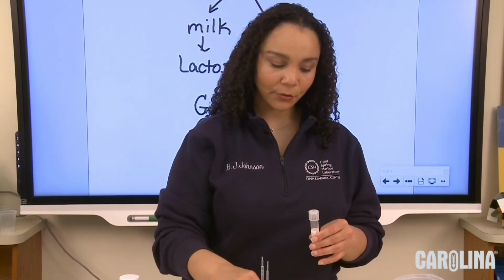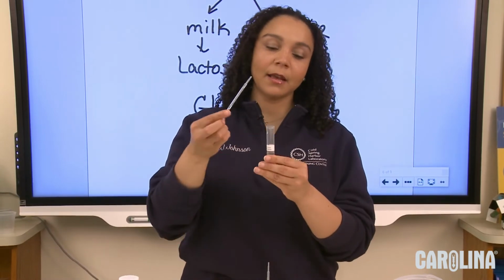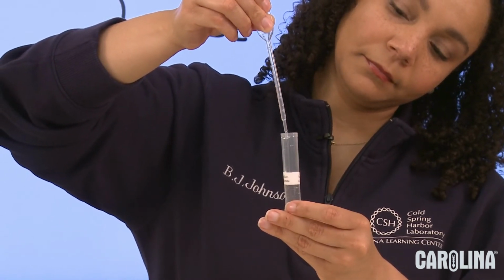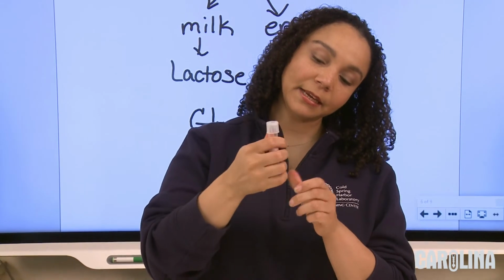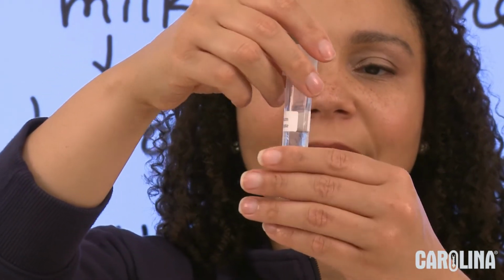After that, I'm going to open my sodium alginate. I'm going to add all of the lactase into my sodium alginate. After I do that, I'm going to close my cap entirely. And looking at it, I can see that it hasn't thoroughly mixed, so I'm just going to flip it upside down to help it with that process, because I want to have a lot of little lactase spheres.